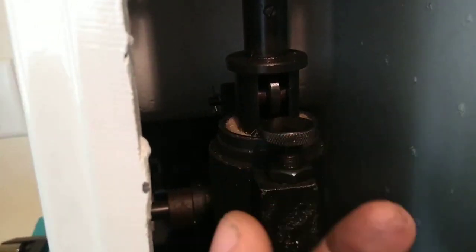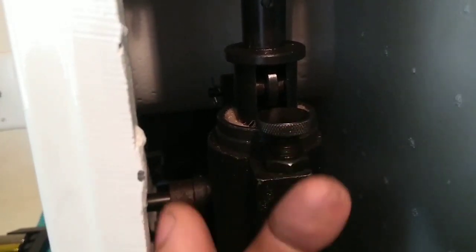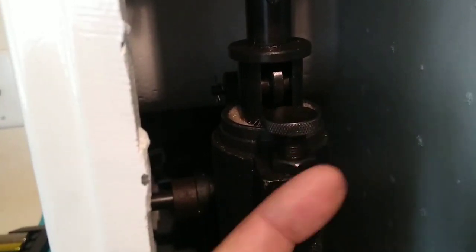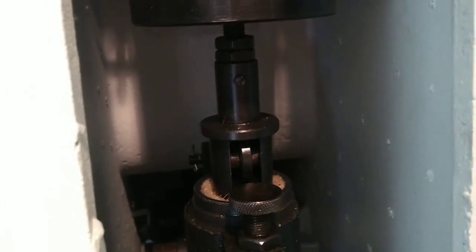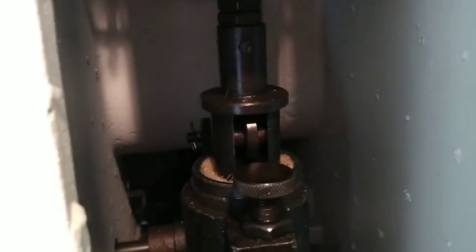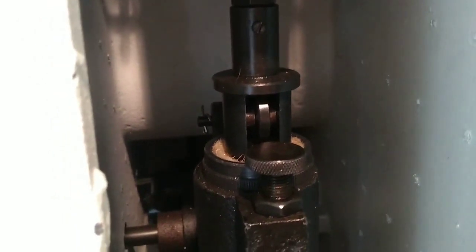We can twist this right here. If we twist it to the left, it will speed it up if we loosen it. If we tighten it, it will slow it down — just make small adjustments. The reason why you don't want it to go too fast is because if it goes too fast, it'll ruin your diamond penetrator, and those can cost about $350, so you really want to take good care of that.